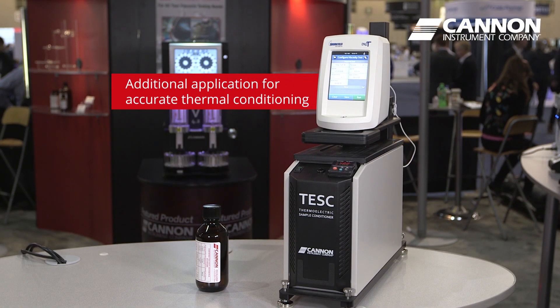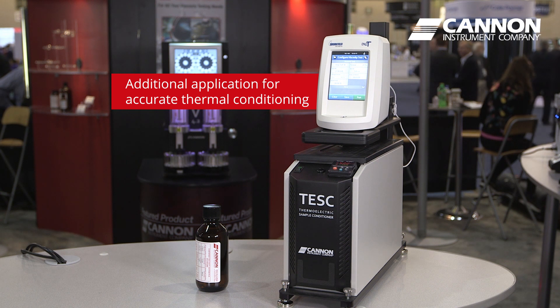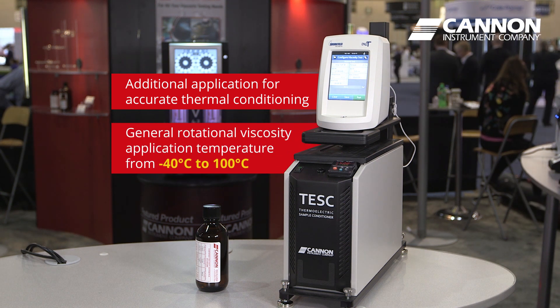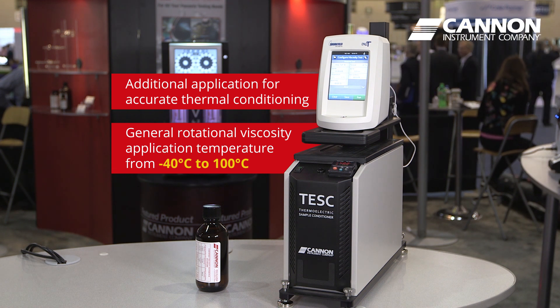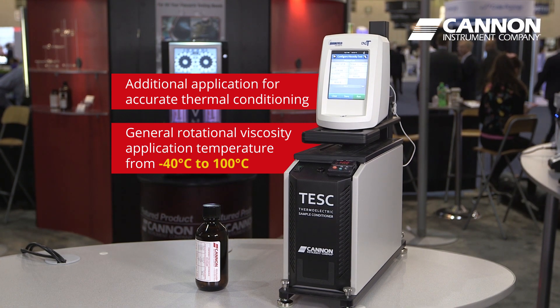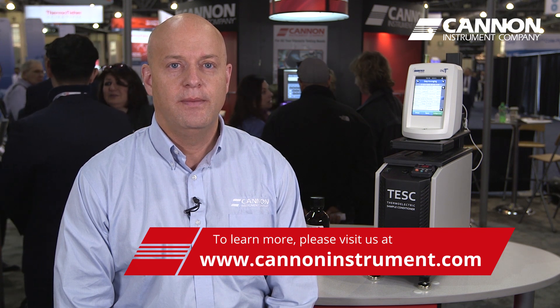We've also found other applications where accurate thermal conditioning of the sample is important. The TESC can be used in general rotational viscosity applications at temperatures anywhere between minus 40 degrees C and plus 100 degrees C. To learn more about our TESC viscometer system, please visit our website at www.cannoninstrument.com.